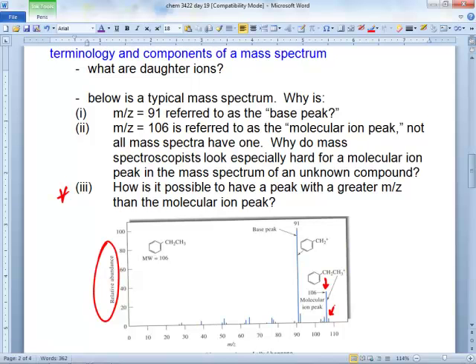No. Because what's going on here is, you can kind of go up to the front or the very end of this. In that flow diagram, what's going on? There's no time for anything like that to really happen. And it's so dilute that there's nothing else there. Because if there was stuff there to be interacting with this, you couldn't get this nice clean fingerprint. So there's a lot of things that have to go right for you to get this fingerprint, right? Especially in that whole chromatograph part. Yeah, you need pure compound coming out of there. It can't be decomposed on you, nothing. Because you're going to get a mass spectrum of whatever's coming out of the column.